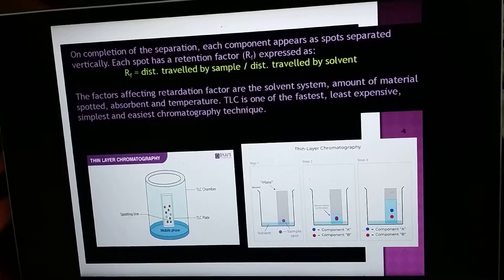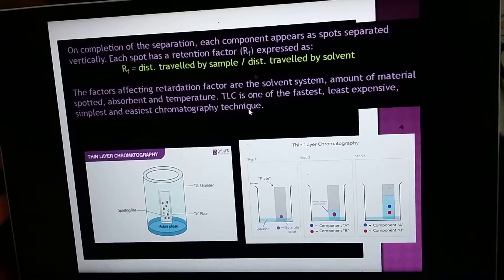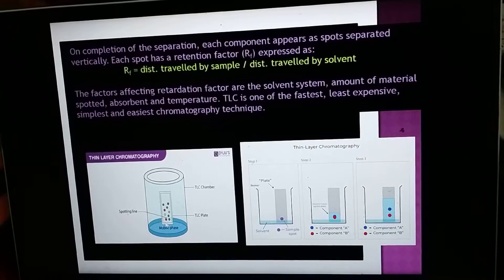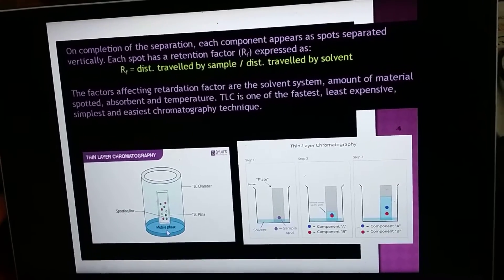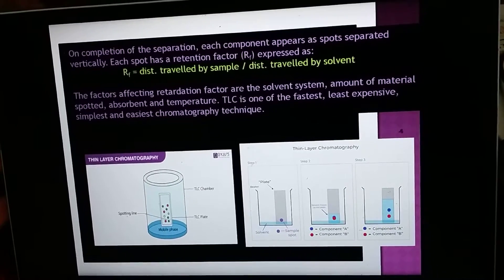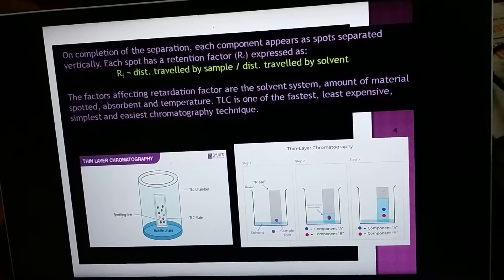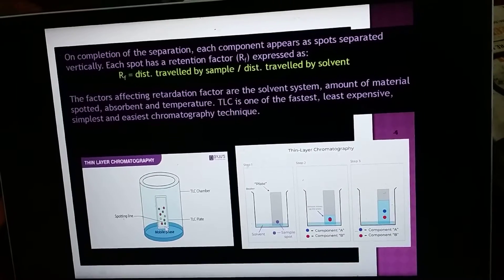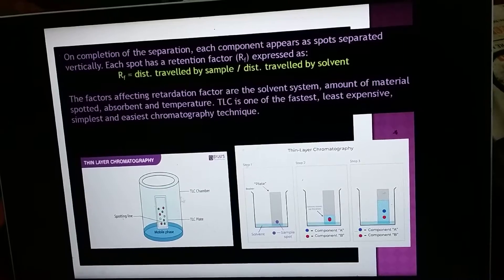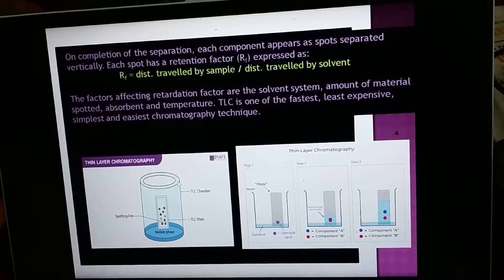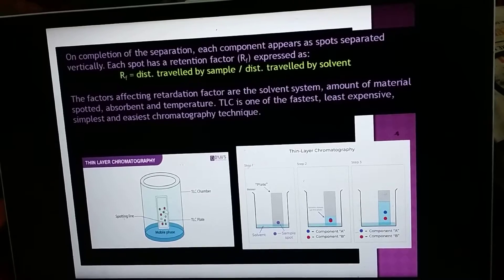Before running the experiment, consider your mobile phase — it may be either hexane or ethyl acetate, or a mixture of both, or methanol or another solvent system depending on the chemical nature of your compound. This is the spotting line on the TLC plate. The TLC chamber must be closed; otherwise your spot will move unevenly on the TLC plate.